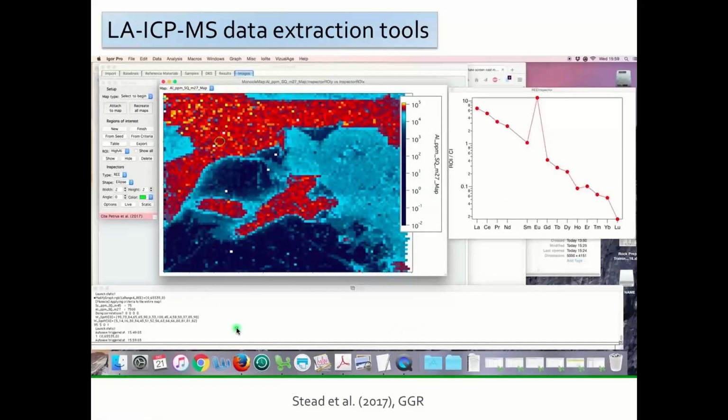Okay, so here I'm going to show you a traverse going from here, from the plagioclase into the olivine, and then going back out into the plagioclase. There's going to be a live rare earth element viewer panel activated, which is normalized to chondrite. So you can see that the plagioclase is light rare earth element enriched, and it has a positive europium anomaly. And we would expect to see, once we get into the olivine, something looking more like this.